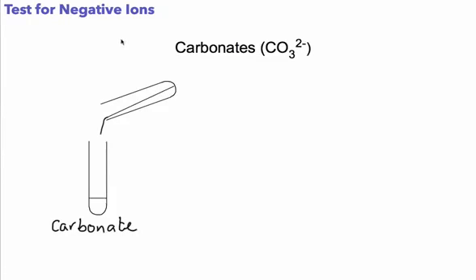Hello and welcome. This is a video all about the tests for negative ions, and the ones we are going to look at are the carbonates, the halides and sulfates.